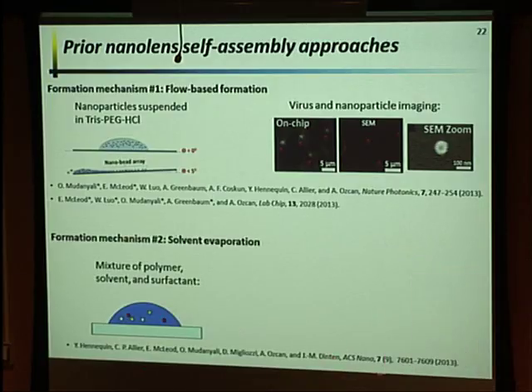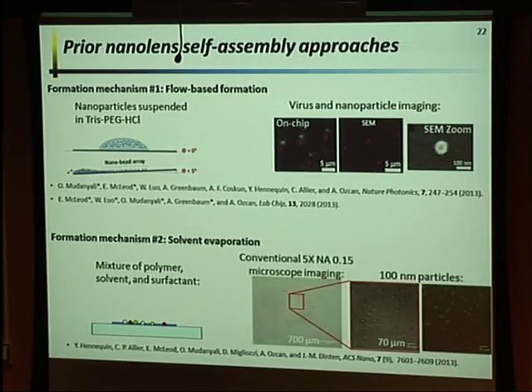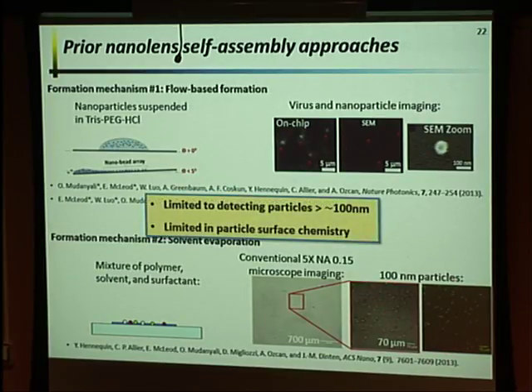We were also collaborating with a French group who were using a slightly different approach, a solvent evaporation approach. The idea is that over time, a solvent evaporates and you get left with a very thin film that's buried around these particles. In their case, they were more interested in imaging on conventional microscopes, but with very low numerical aperture. So you get the same sort of benefit: a very large field of view because we're using a low magnification objective, but with much higher sensitivity than you would normally have.